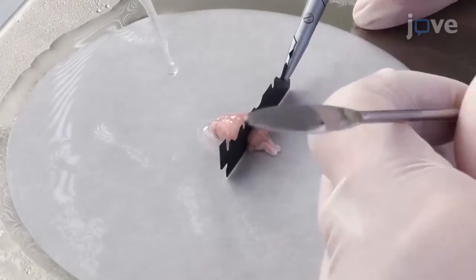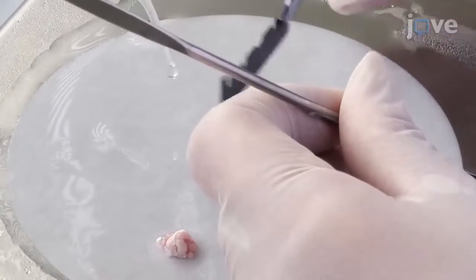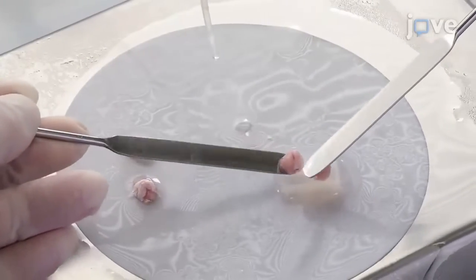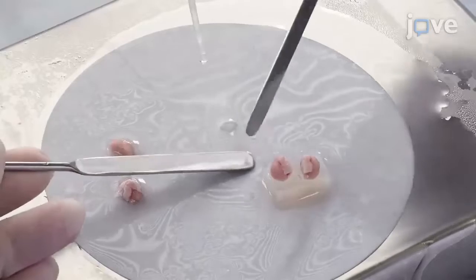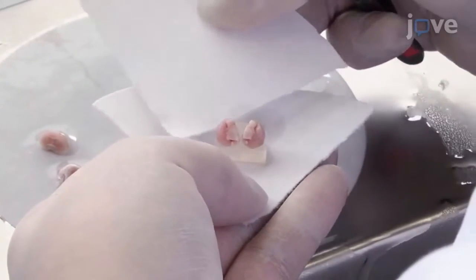Next, divide the brain at the midline with a scalpel and place both hemispheres onto a 4% agar block. Then wipe the excess ACSF from the block with a filter paper.